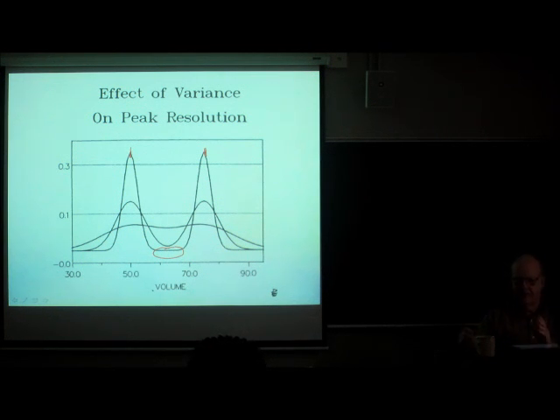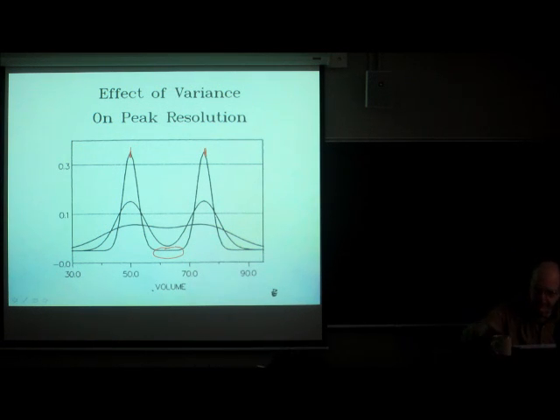This is really what you're after when you're doing chromatography. You don't want a mile of baseline between them, because that's wasted time. But you definitely want to see baseline between your peaks. Assuredly, when you're quantifying the peaks by measuring the area underneath them and integrating them, you definitely want to get to baseline, if you possibly can.